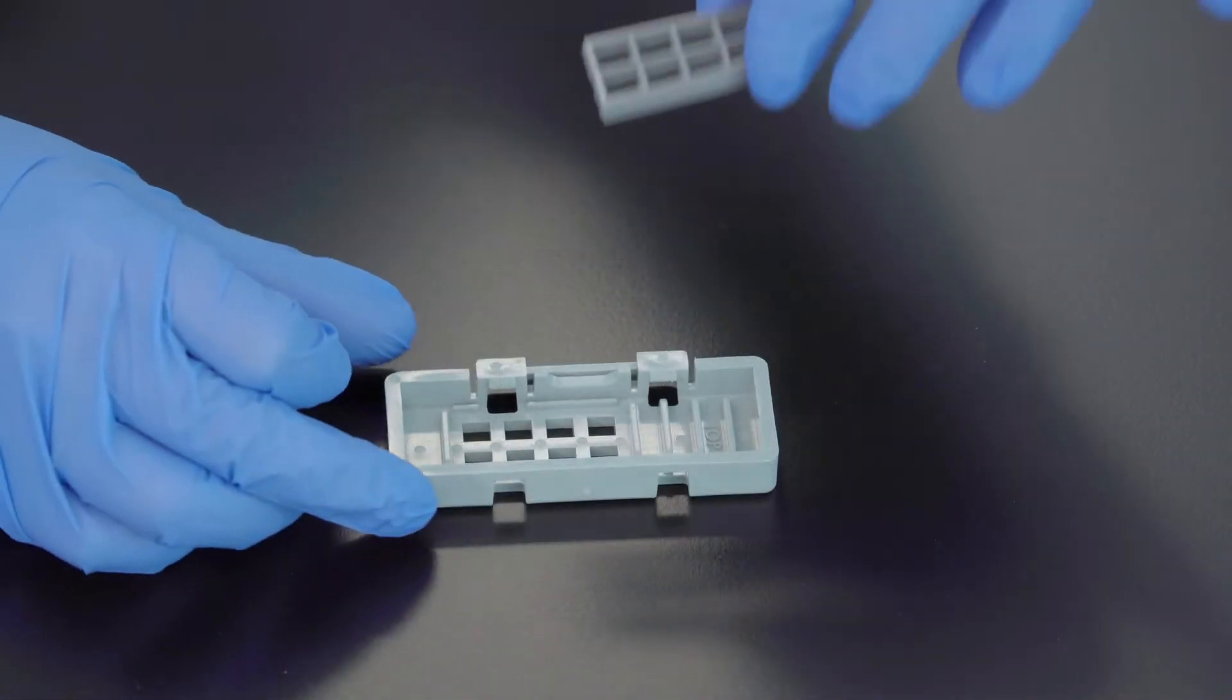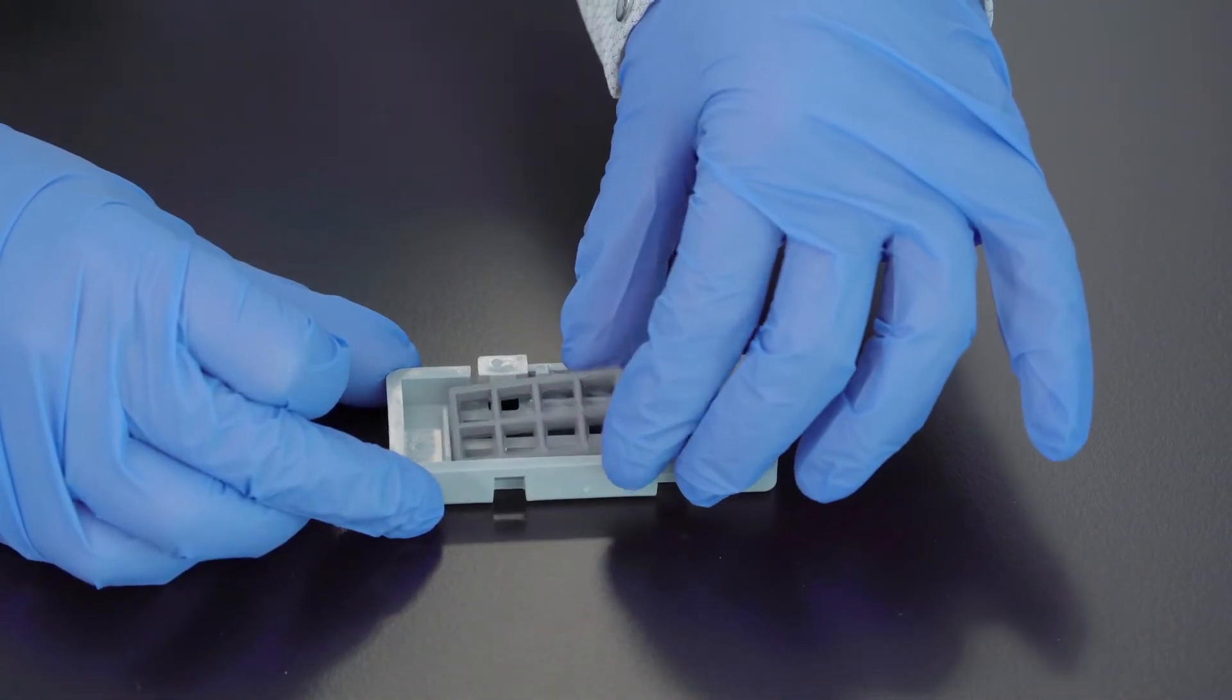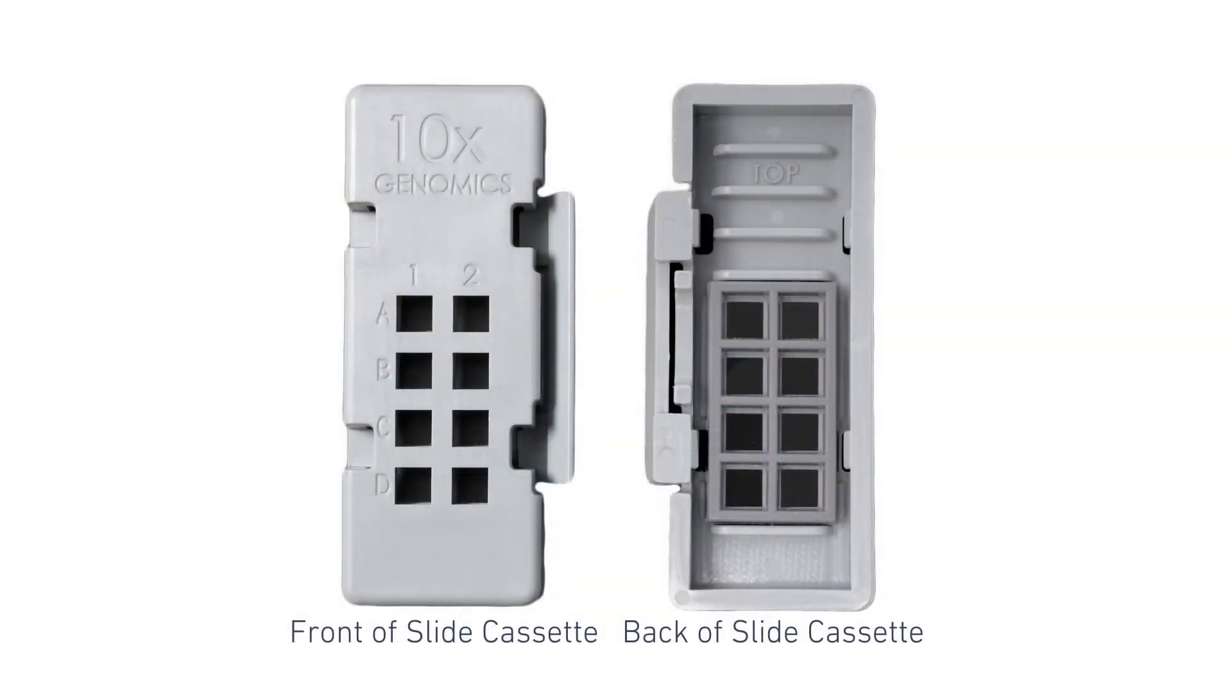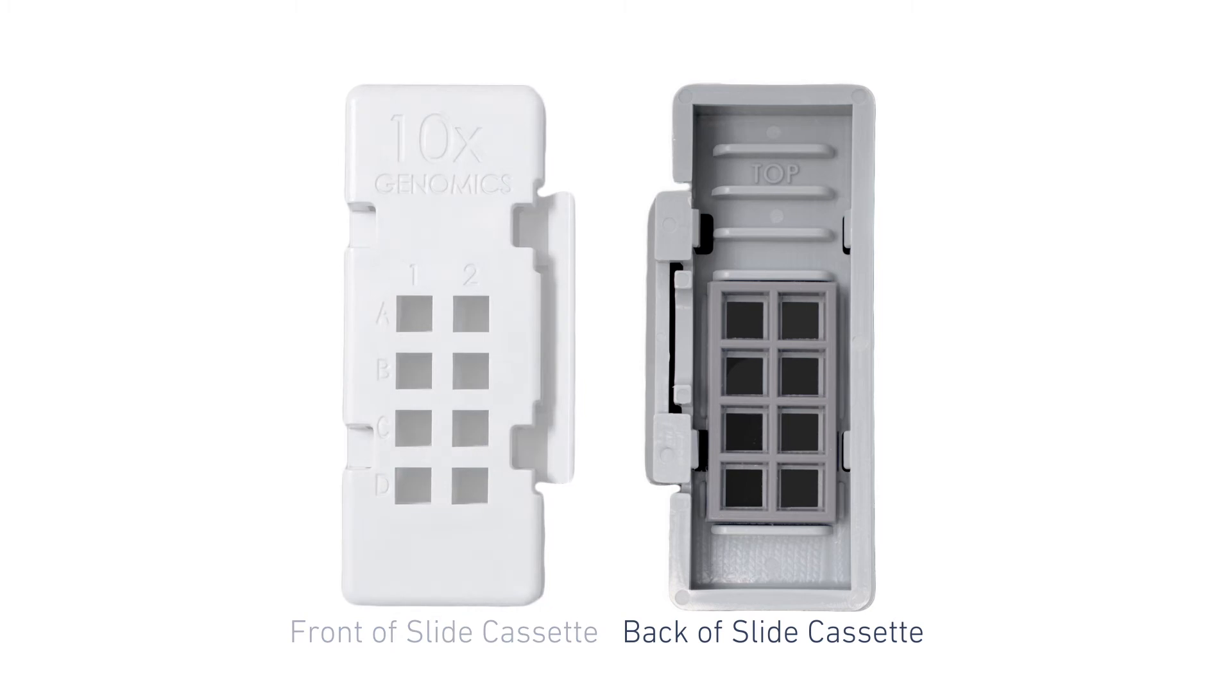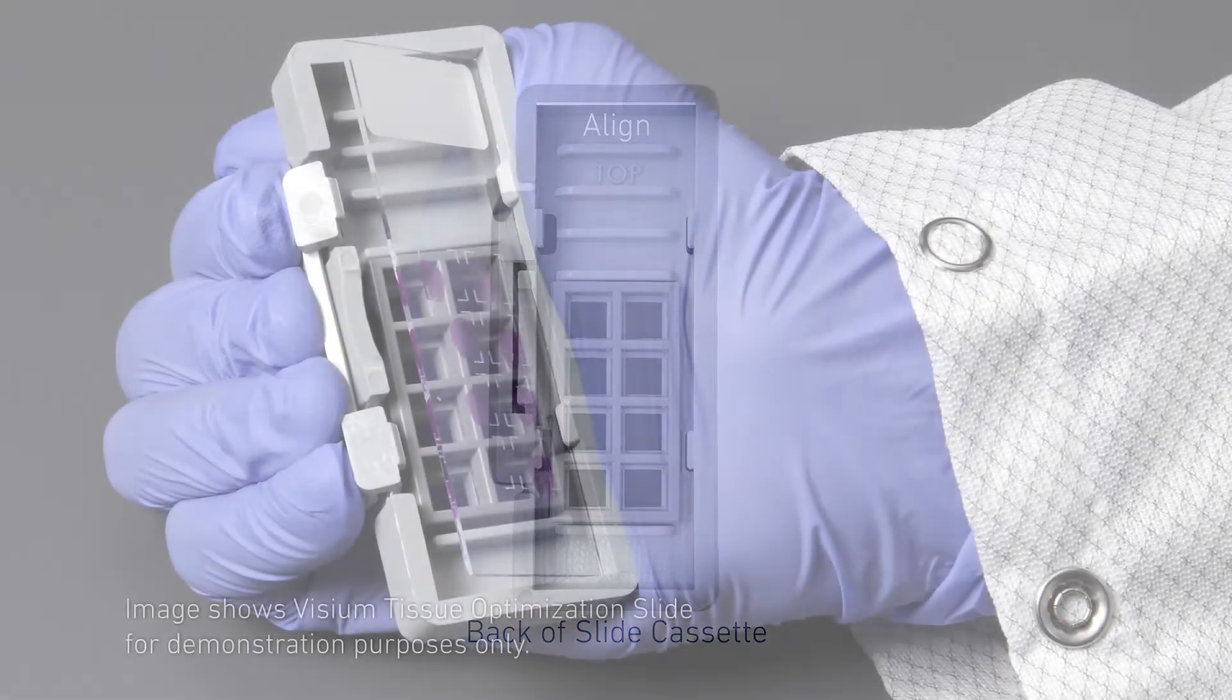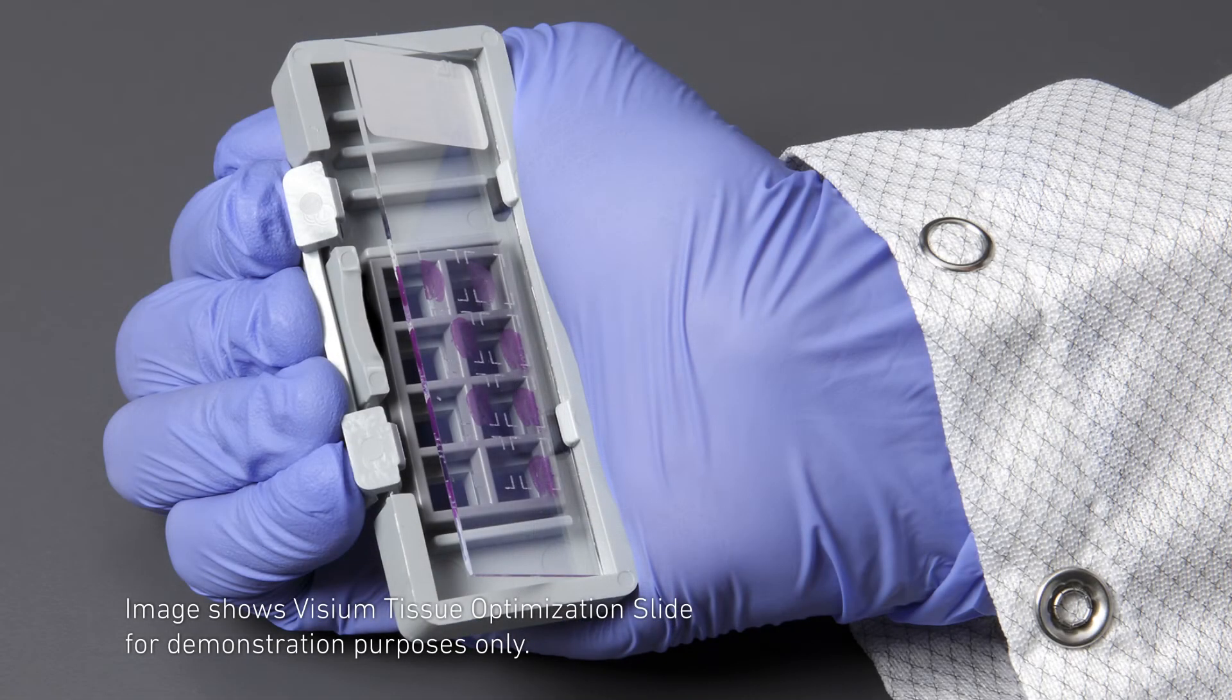Insert the gasket and align the gasket and slide cassette cutouts. Ensure that the back of the slide cassette is facing the user prior to assembly. Align the label on top of the slide to the top of the slide cassette.